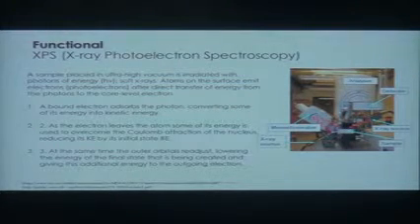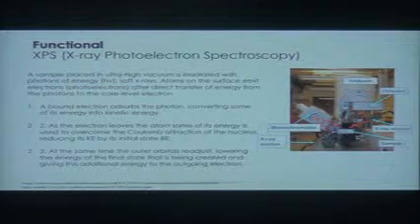XPS is a functional technique. We use this quite a bit. It's usually somewhat specialized. The equipment is very expensive, but it's extremely useful because it tells you about bonding in the material. Again, it gets back to not just knowing what elements you have, but knowing how they're bonded together.